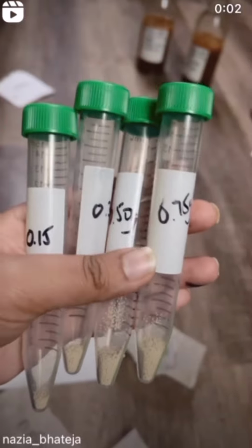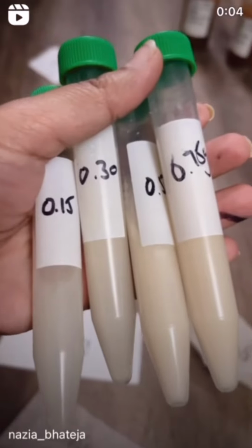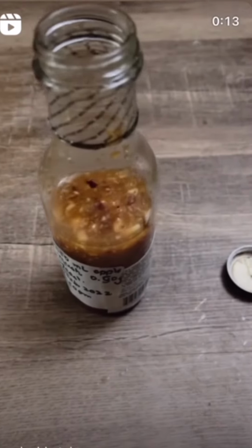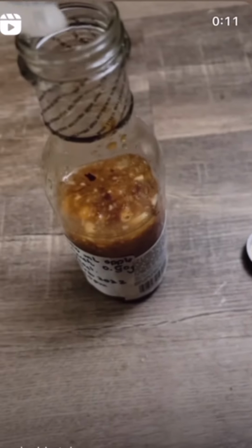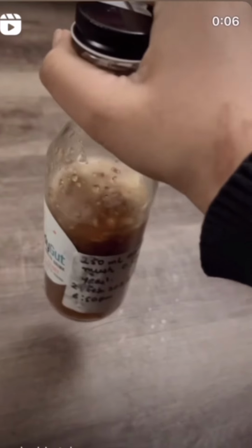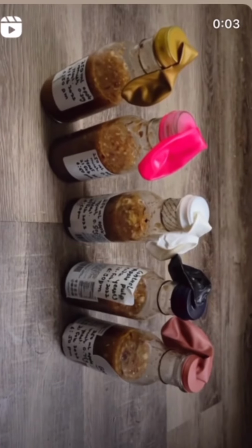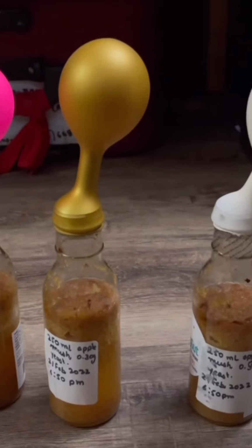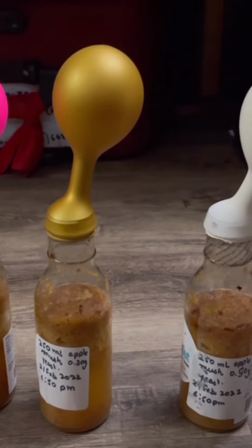Then the yeast is put in different tubes for activation, and the yeast is set aside for 10 minutes for activation. 10 minutes has passed, so I am mixing the activated yeast with the fruit pulp and then mixing it properly by swirling. After that, I attached balloons on all the bottles, and the darkness is provided by a blanket. So let's start measuring carbon dioxide now.